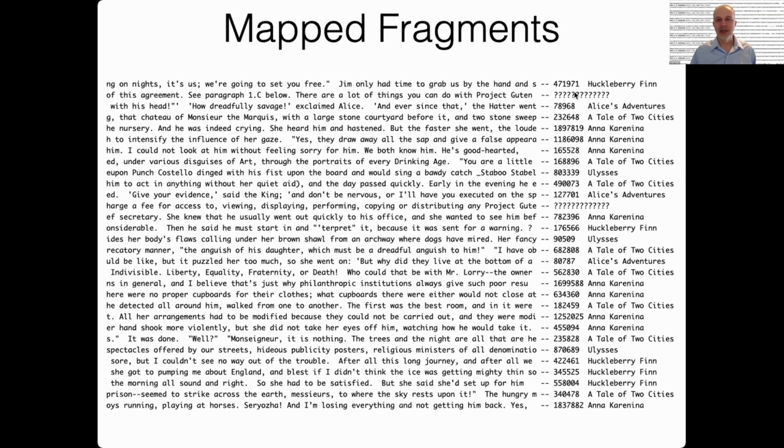And actually, I didn't mention this before, but just because we can, here's the title of the book that the fragment came from, and then I'm also indicating the character number that the first character here matches, right? So this N here, if you look in the text of Huckleberry Finn, book by Mark Twain, this character here is character 471,971 in Huckleberry Finn.